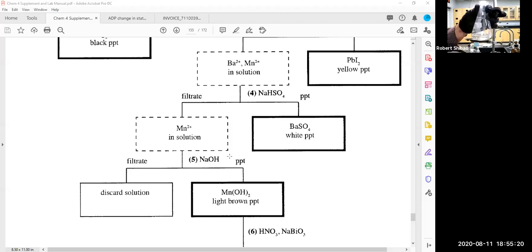So that's 1 squirt of sodium hydroxide, and there's no precipitate there. We'll just put 1 extra just to make sure. That's 2 squirts of sodium hydroxide, so there was none. And so this one also consists of just 1 cation.